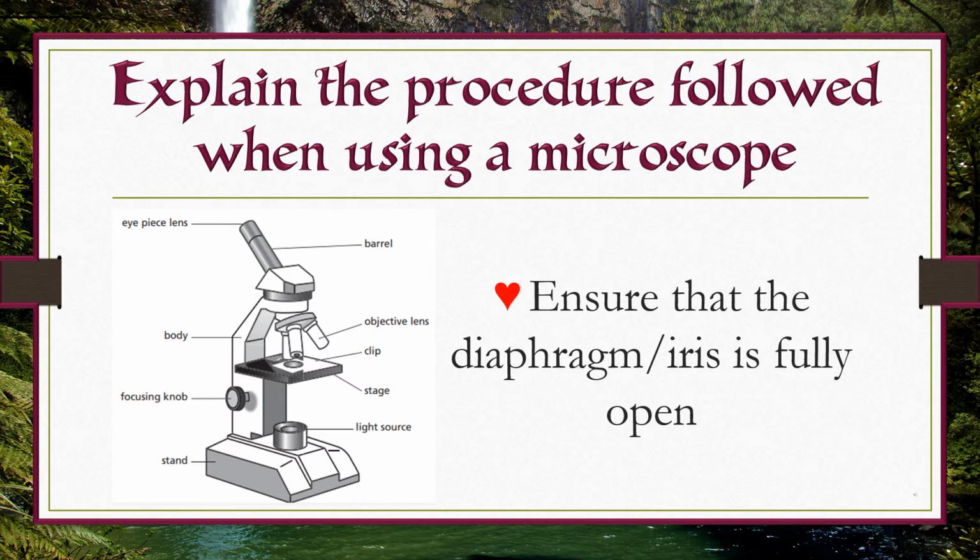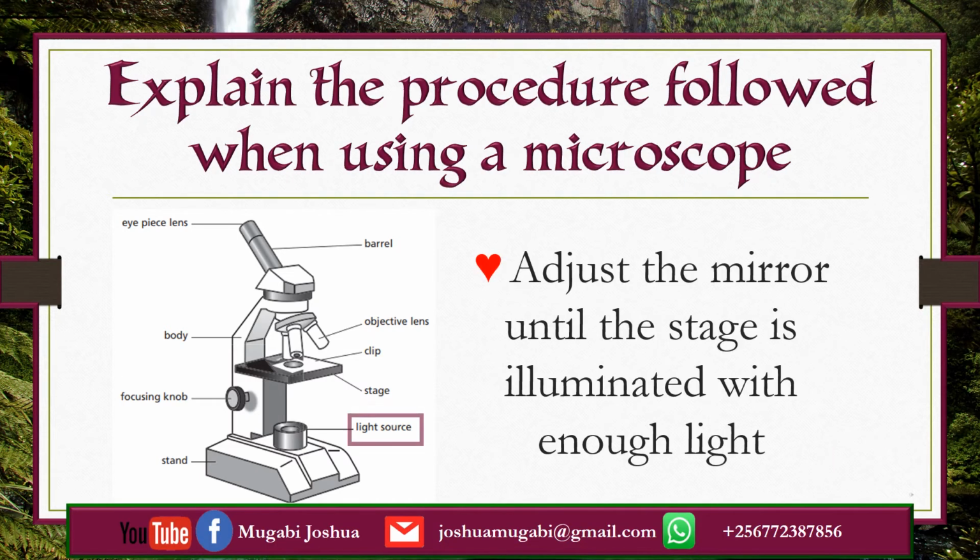Ensure that the diaphragm is fully open. Adjust the mirror until the stage is illuminated with enough light.